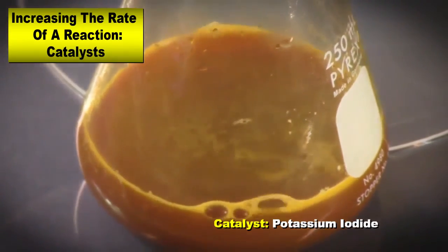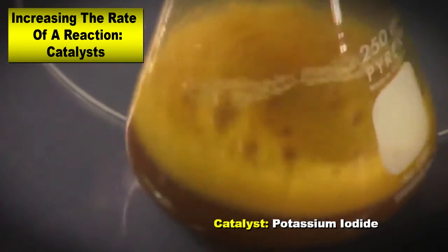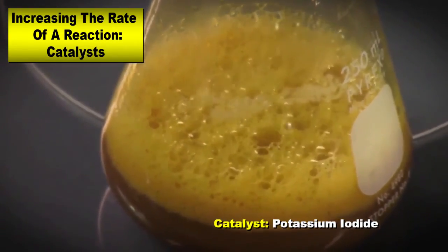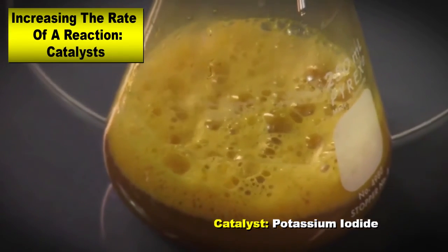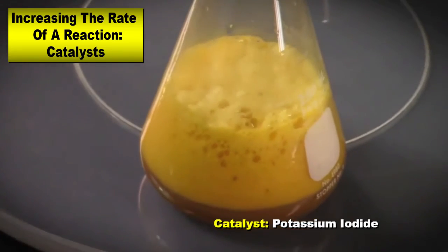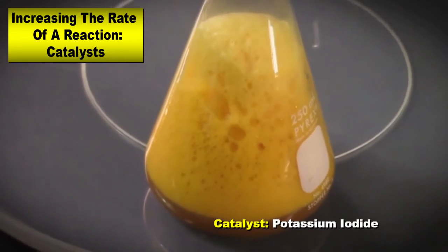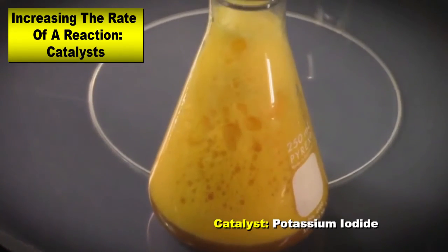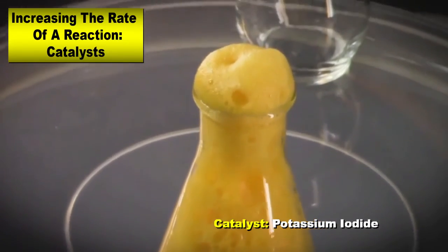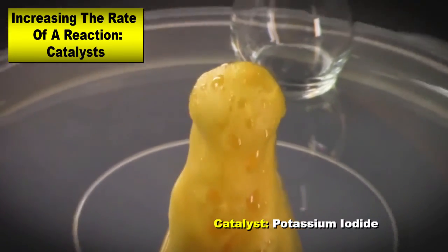You can feel the warmth, but you can certainly see that the bubbles have not gotten too crazy yet. One of the ways that we can increase this, obviously, is by mixing it. But you'll see that the reaction here is definitely not as aggressive as what we saw before, until right now. And you can see it's steaming up a little bit on the inside. It's burping a little bit there. There we go. All right, success at last.